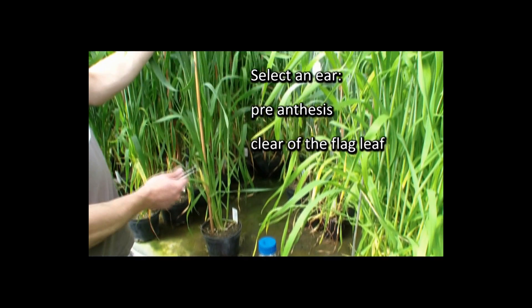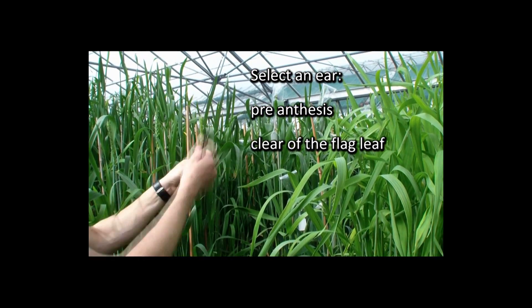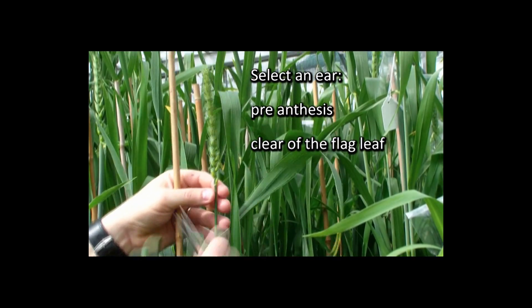First we select the ear that we're interested in. We're looking for an ear that's pre-anthesis but clear of the flag leaf.